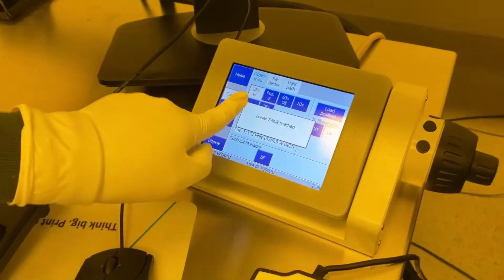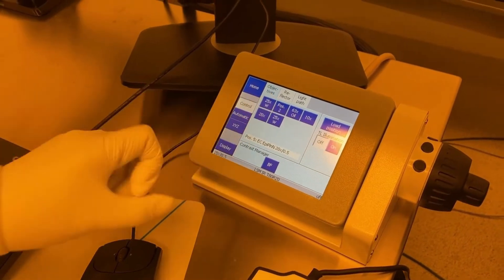Once the NanoScribe is set, go to the smaller screen right by the computer and pick which lens you will be using.